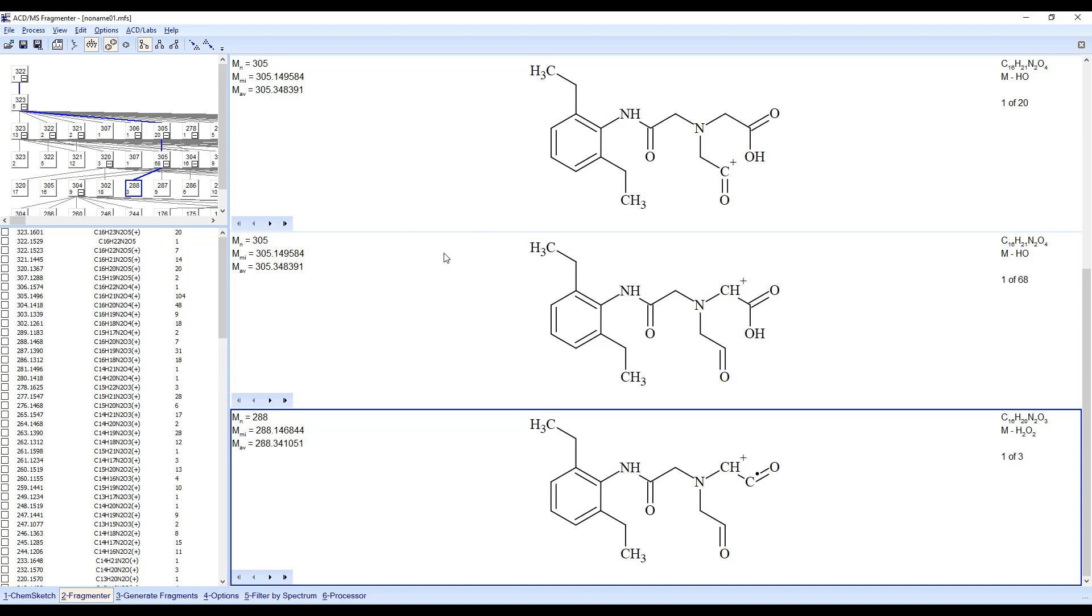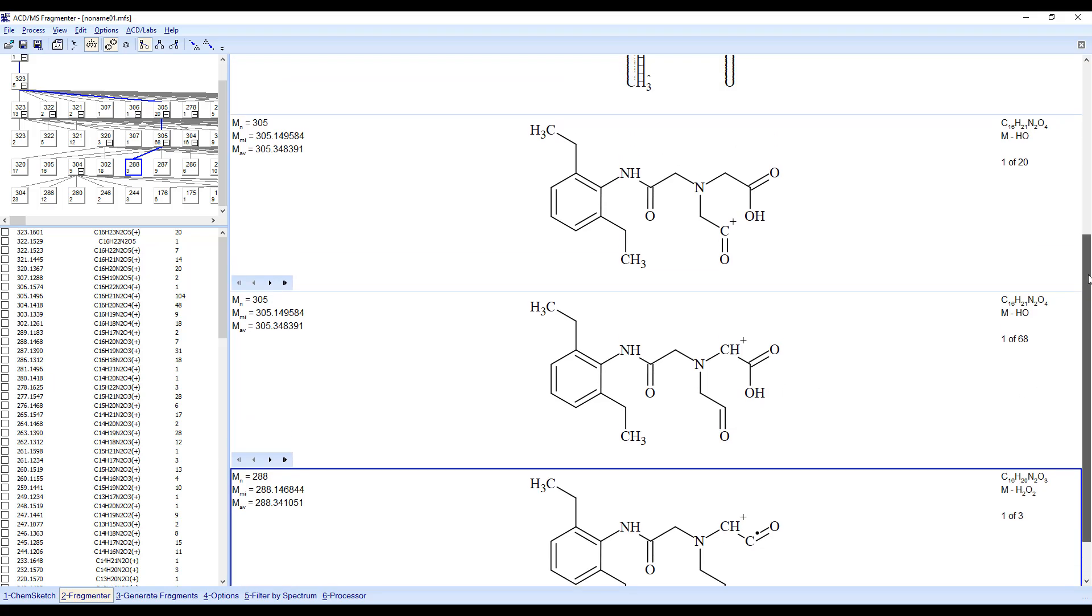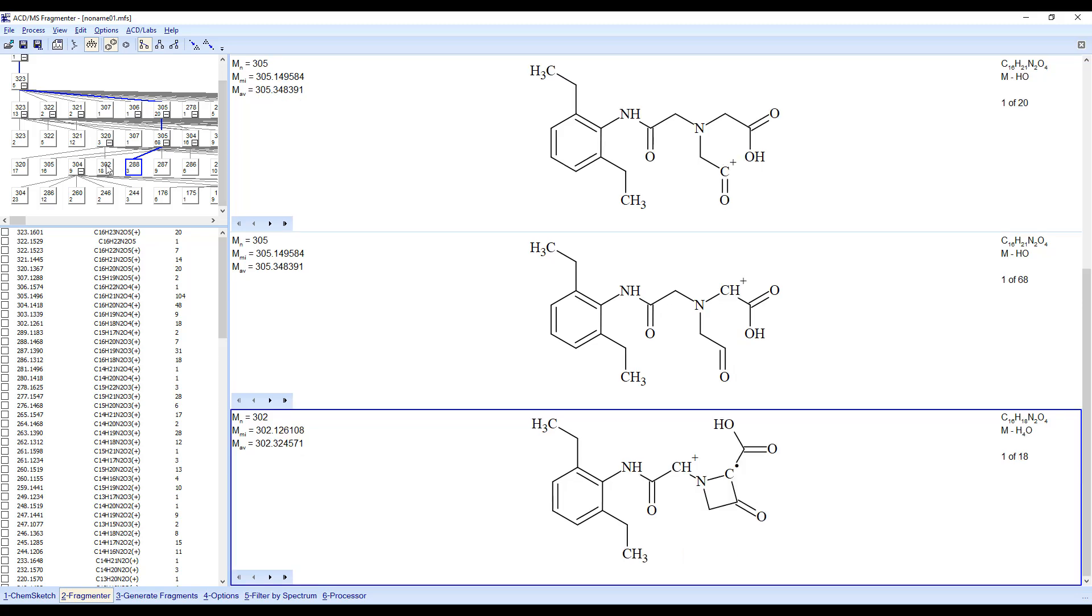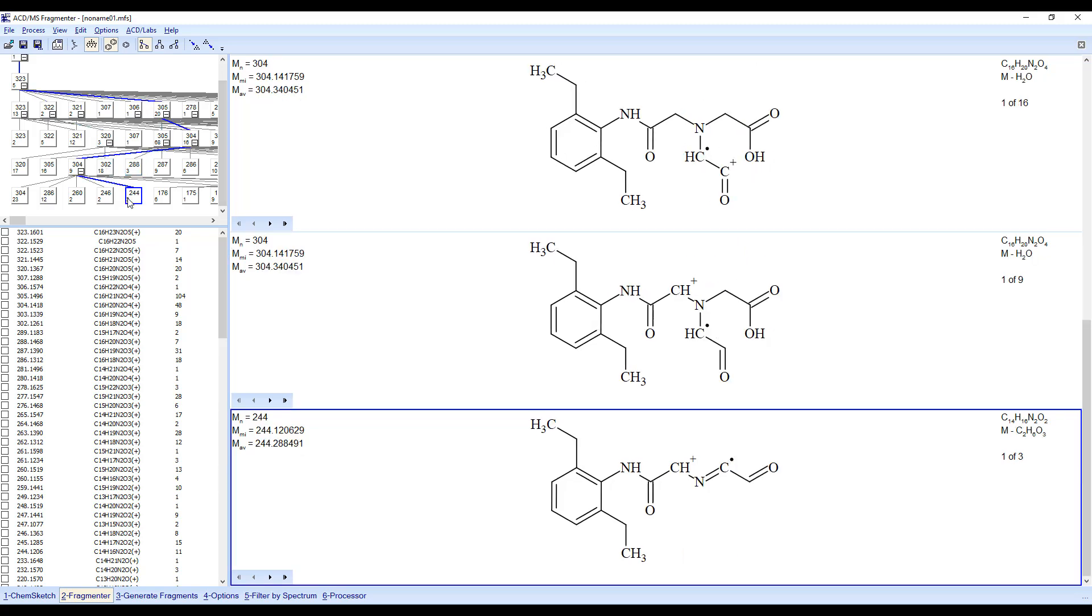Here, you can see the possible structures of the fragments. Clicking on an entry in the list will cause the structures to change to correspond with the selected entry.